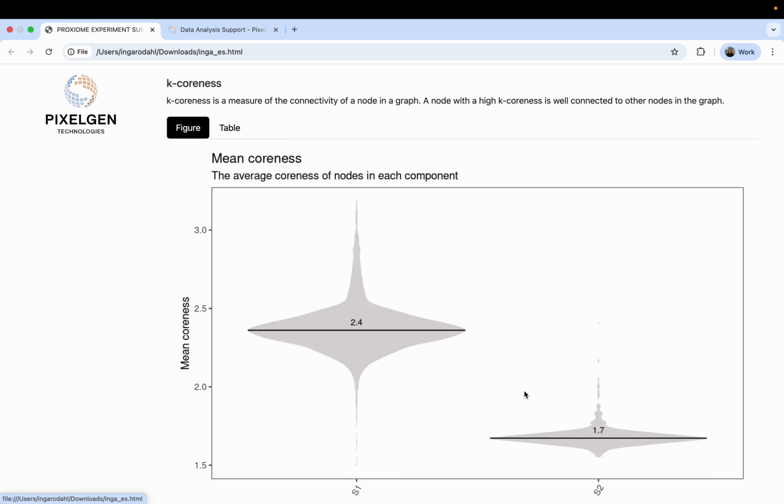So here you can look globally at any marker that you prefer. We can look at ICAM1, for example, which you see here is slightly up in the second sample globally. And then when we look at per cell type, we see that ICAM1 is actually clustering on multiple different cell subsets. And ICAM1 is important for activation of immune cells to facilitate cell-to-cell interaction.